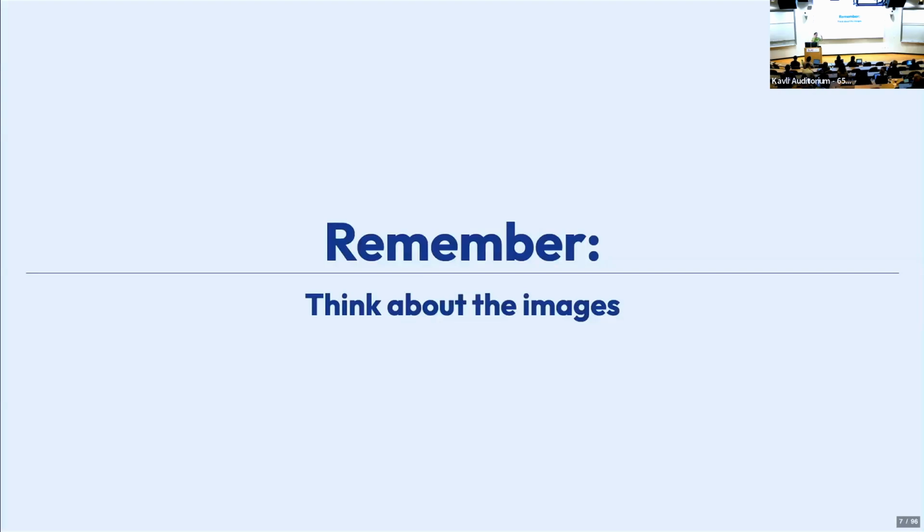Unfortunately, I think it's best to think about the images, right? Because what we're actually doing is performing these image alignments that we'll talk about in a bit. We're classifying the images, right? And so I think if you really focus when you're launching a job on what's happening to the images, you'll have an easier time figuring out what the next best step is. And so throughout, I have some prompts to think about what these jobs are doing to the images themselves.